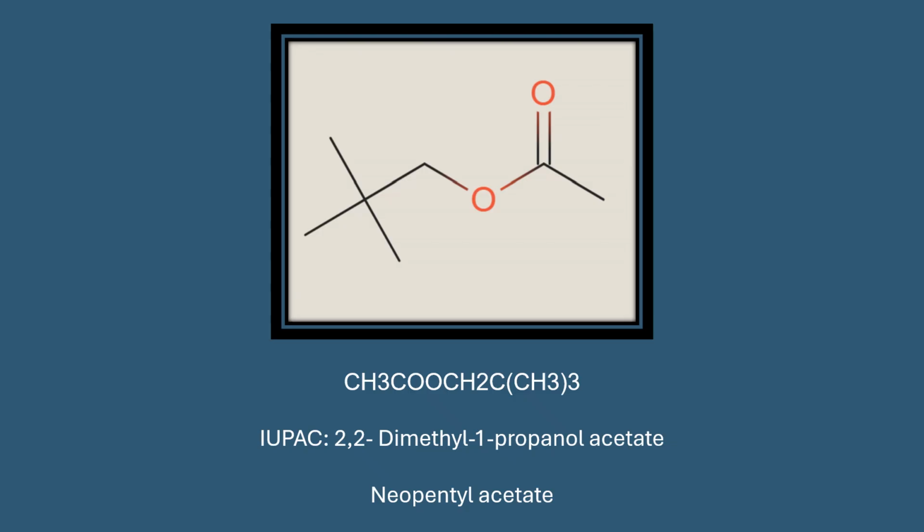The collective information provided shows that this compound is neopentyl acetate, IUPAC name 2,2-dimethyl-1-propyl acetate.